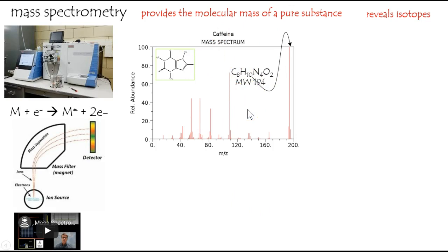And then you come up with candidate structures. Now, the problem with mass spectrometry is there's going to be a lot of isomers that can fit this. Oh my God, so many isomers. Most chemists at this point would take what they call an NMR of the sample, which would give them a detailed map and lead to this structure here. But if you had to guess among isomers, you can turn this formula into how many double bonds and or rings it has. It could also be, of course, a triple bond, which is equivalent to 2 double bonds. So sometimes they call this a double bond equivalent analysis or an index of hydrogen deficiency.